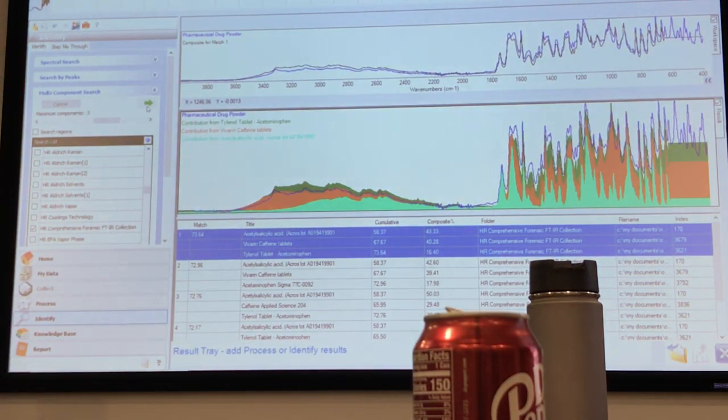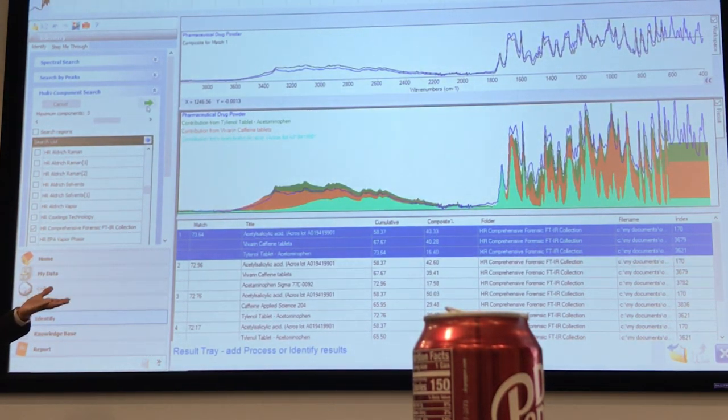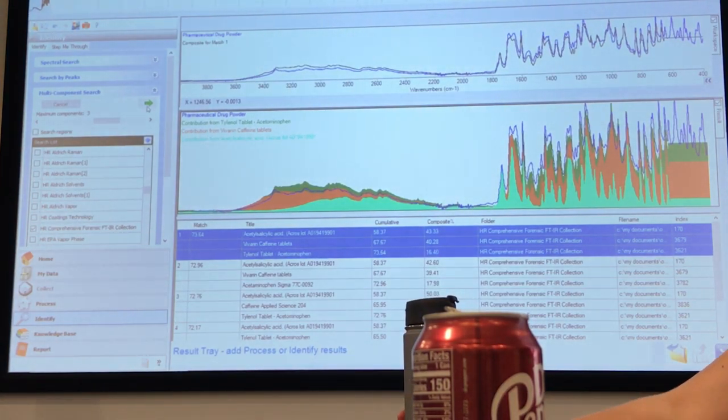Because this is where you see that two extra pieces, oh, that means there's something else in there, right? So you go do more searches, one at a time. It gives us more control over it. But a lot of times, as I think Andrew had mentioned in his talk, if you are somebody who has done spectroscopy for 45 or 50 years, you look at a spectrum and say, no, that's a multi-component of so-and-so, because your eyes are so trained that you may just go in and do three or four components. But if you're looking at a spectrum for the first time, and you're trying to get the best that you can out of it, then it's better to go step by step.